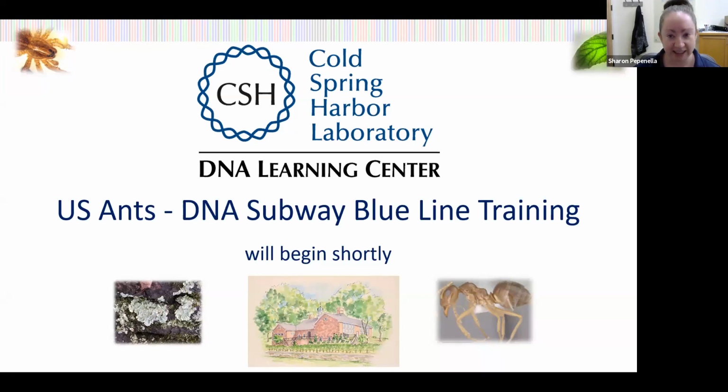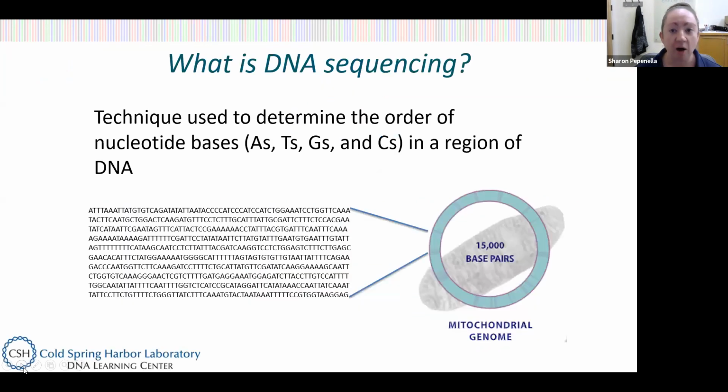But before we get into this, we really want to talk about what is DNA sequencing. So I'm going to spend a little bit of time explaining what DNA sequencing is and how DNA sequencing works, because what we will see is the raw DNA sequence data in DNA Subway. It'll be the very first thing that we see. So what exactly is DNA sequencing?